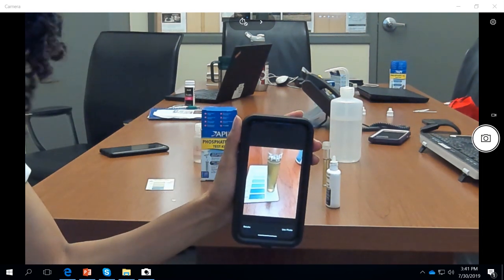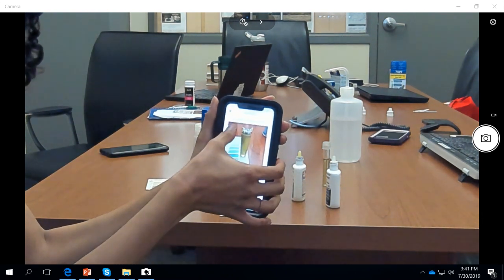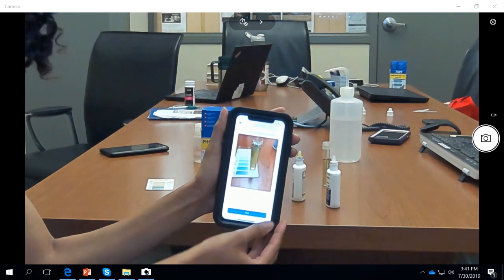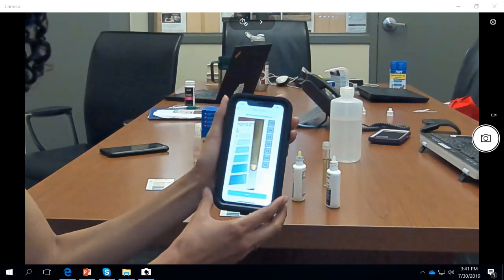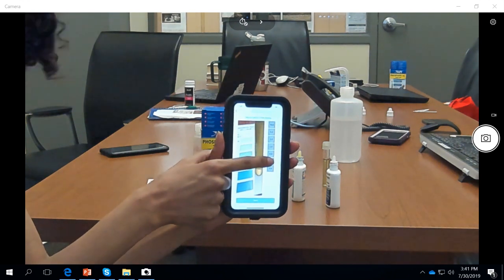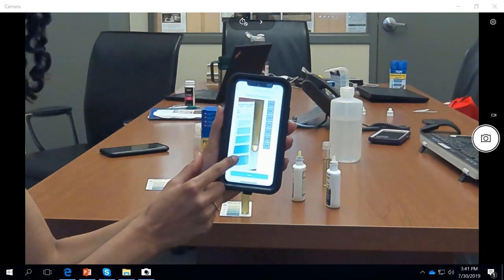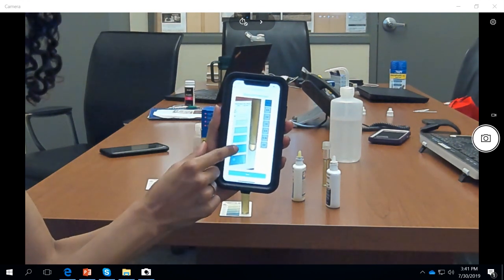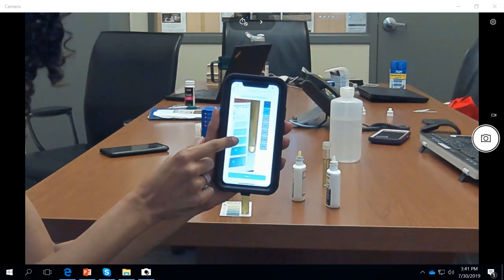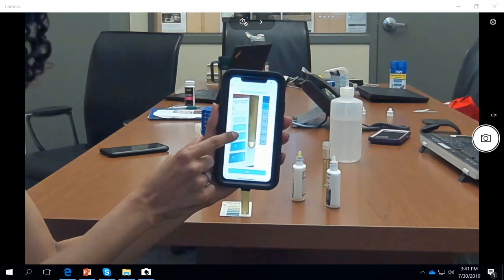If the image is appropriate, you can use the photo and zoom into the photo so you can see just the test vial and the reference colors. Go next, and now you can match the reference colors to the reference boxes found in the app. Make sure you match all the boxes correctly. Start off with 10 to 10, 5 to 5, making sure that you select the center of these boxes, not on the edges, and with no reflections or shades.